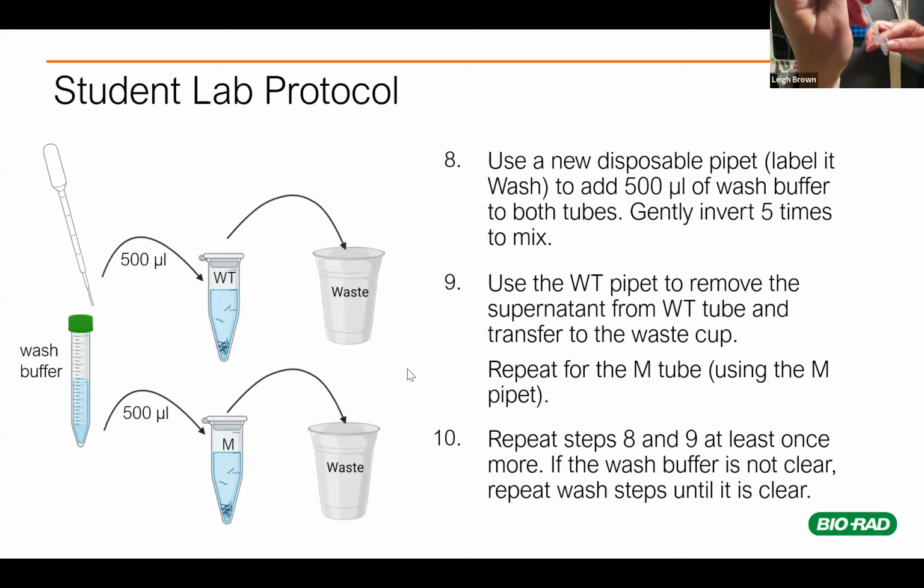So usually, or at least when I do this one, I usually do at least 3 washes because I like the worms to be really hungry because that way I know I'm getting better results usually. And so I think, do we have enough buffer to do it 3 times? We have about 10 mils of wash buffer. Oh yeah, you guys are good. Plenty. Okay.